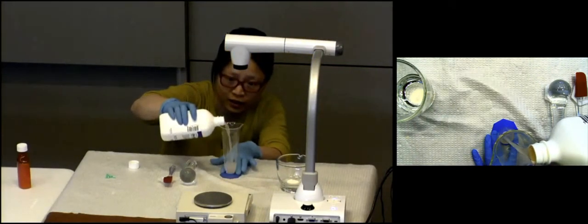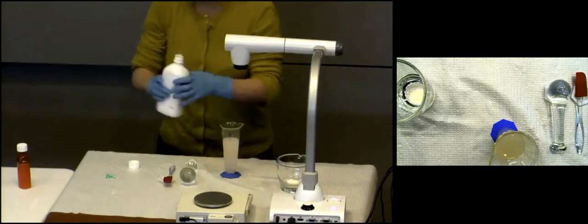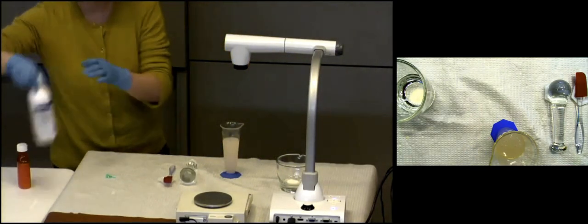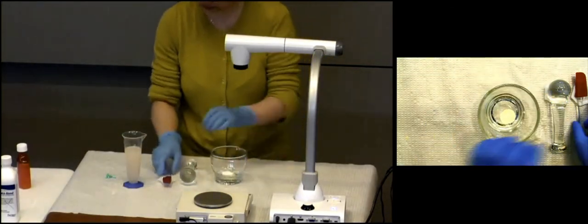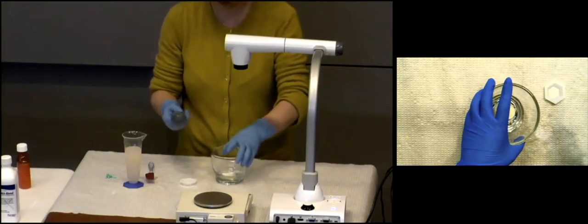Why the conical over the cylinder, though? Which one is taller? The cylinder, because it's more narrow. Would you agree? The more narrow, the taller it's going to be to get that volume. So when you go to pour out your viscous liquid, what's it going to do? It's going to stick along that whole length of that glassware, and you'll lose even more. So the conicals are fatter, so they aren't as tall, so there isn't as much loss.